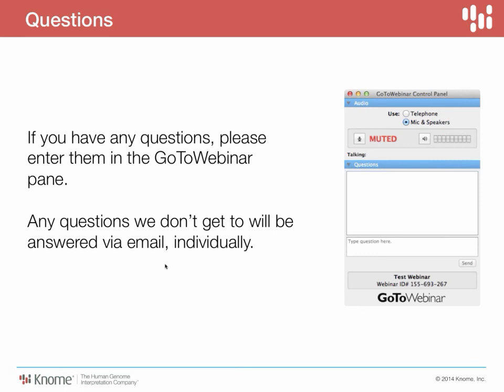Looking through these, another question that came in is, are all annotations done within the Gnosis, or does someone need to pre-annotate their VCF files? No, there's no pre-annotation. The VCF only needs to have the sequence data. So what are the variants? What is the genotype? Allelic depths, total read depth, all of the quality information that you would want to have access to later, it should be in there.